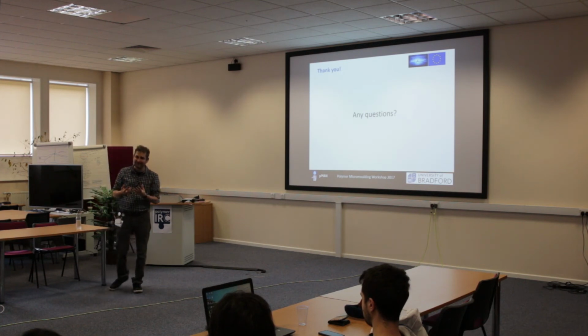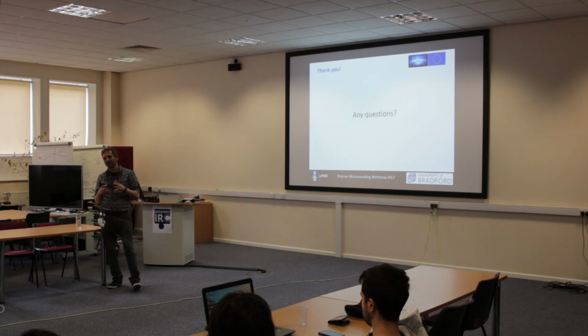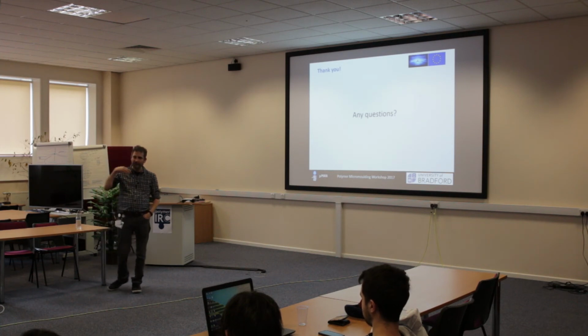They're not statistically representative. And the typical TEM image you see in every paper is not typical, because if you were producing a paper of all your work for 3 years, would you choose a typical TEM, or would you choose your best image? Which one would you put in? Okay, so there can be a huge amount of work in looking at this very fine structure, but actually the fine structure might not be truly representative of your sample.